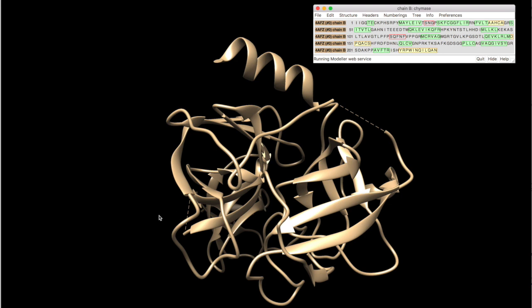In a moment you will see the software progressing. In a moment you will see the result, the resulting model built using loop refinement protocol from Modeler.